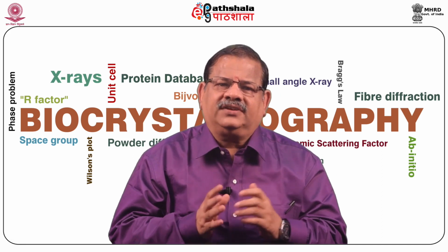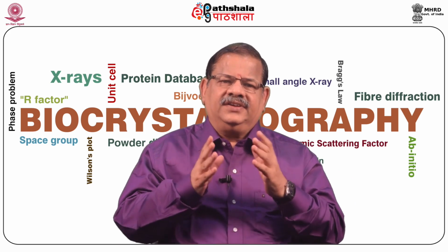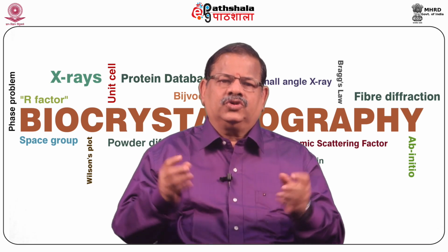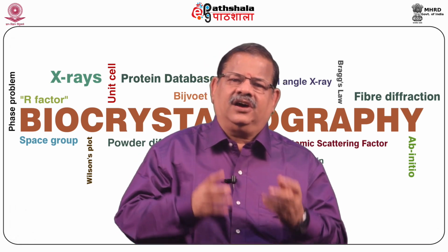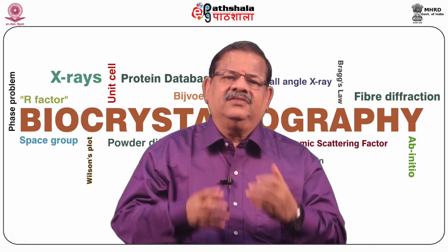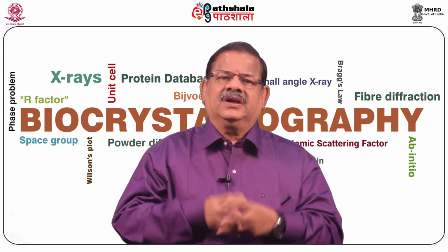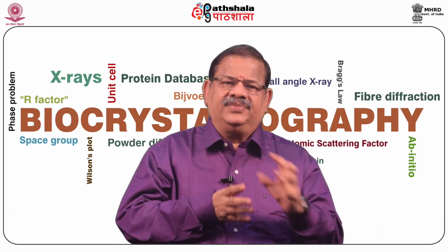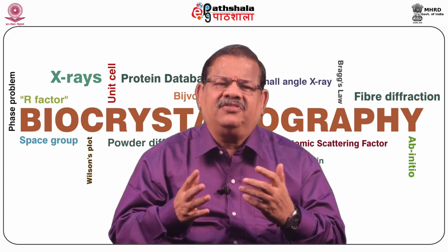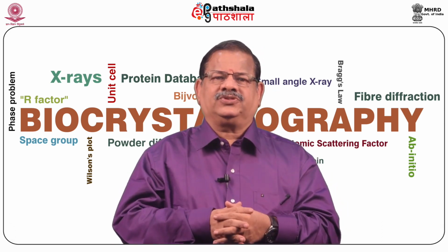The other powerful alternatives are the single wavelength anomalous diffraction, SAD, technique with native anomalous scatterers like sulfur or phosphorus, or soaking experiments with halides or iodine combined with multiwavelength or single wavelength anomalous diffraction experiments. In the above methods, calculation of phases from these heavy atom sites is more important. Although Patterson maps are very useful in the above calculations, direct methods have also been proposed.